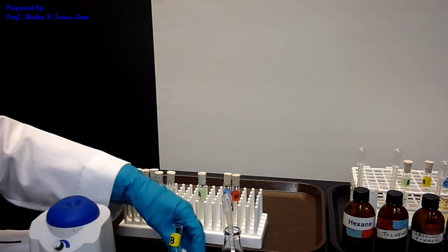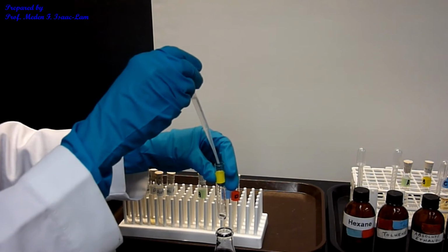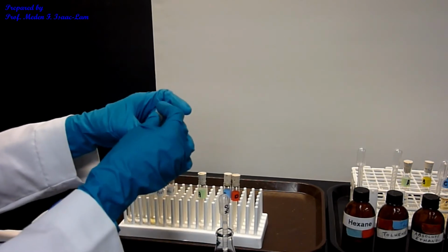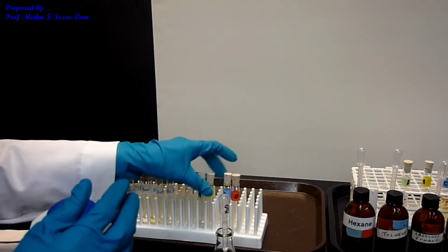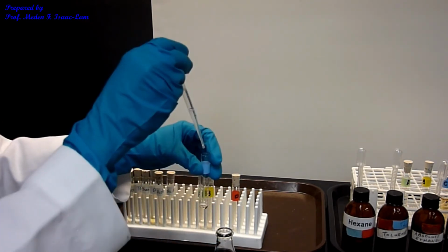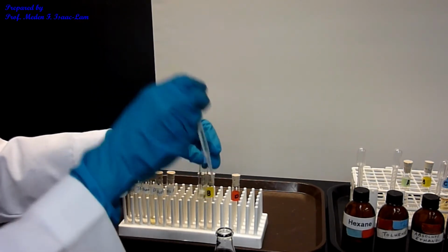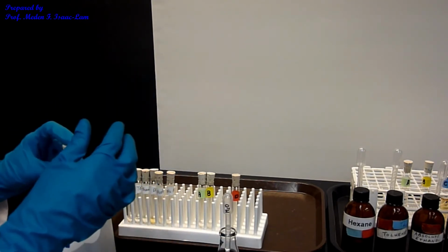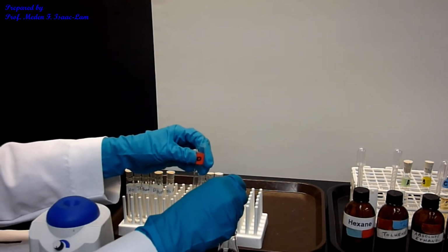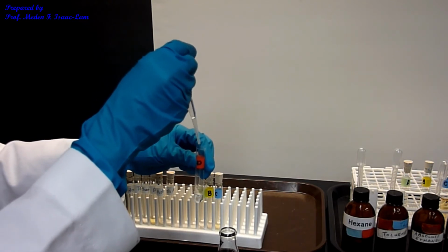And then unknown B, and then unknown C, vortex, and then unknown D.